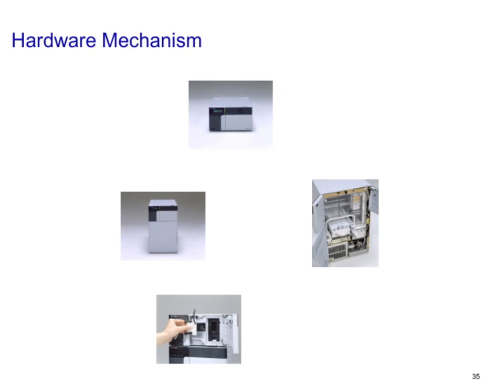Next, we have the injector connection, which is another vital component. A secure and reliable connection ensures consistent injection of samples or reagents without leaks or interruptions. Properly designed injector connections help maintain system integrity and improve reproducibility.